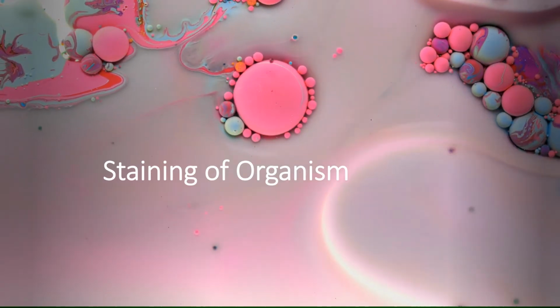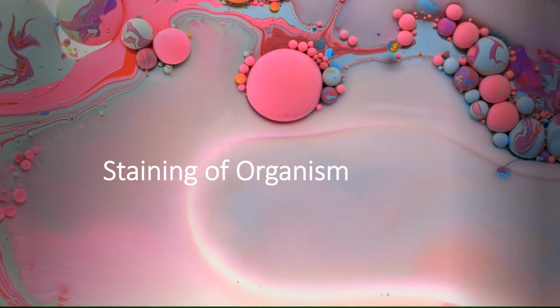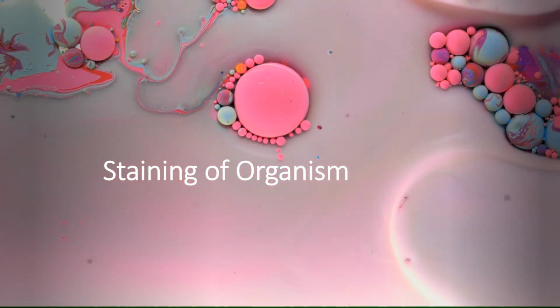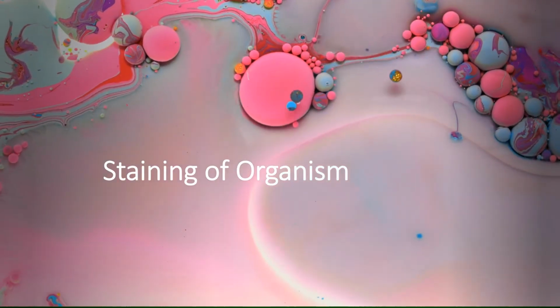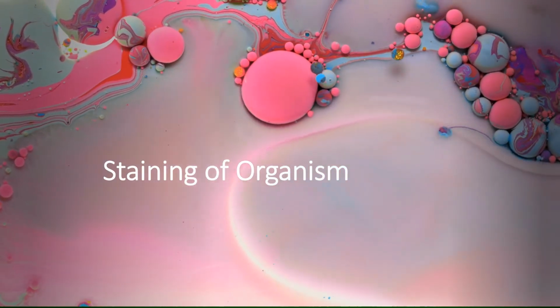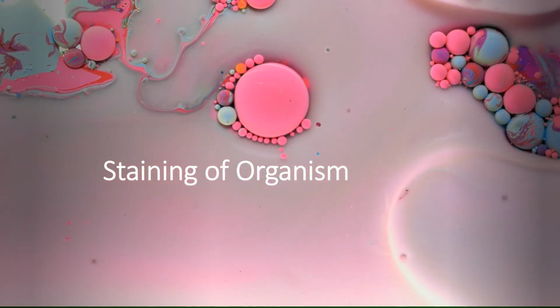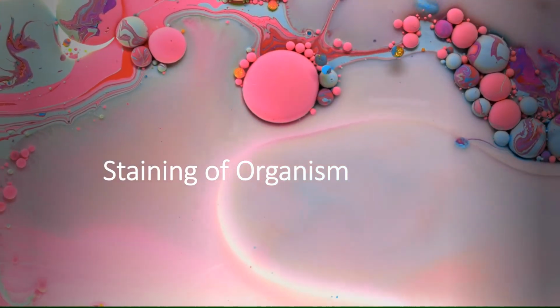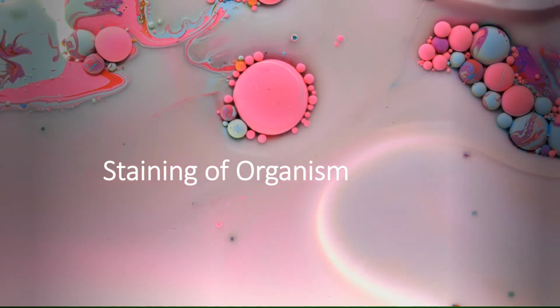So finally we got to start with staining of organisms, and while listening to staining of organisms, there are two questions that come to our mind. What is staining and why do we need it? The procedure of making translucent organisms colored or stained is called staining, and we need it because translucent organisms cannot be studied under microscopes properly. So to make the translucent organisms visible, we need to stain them.